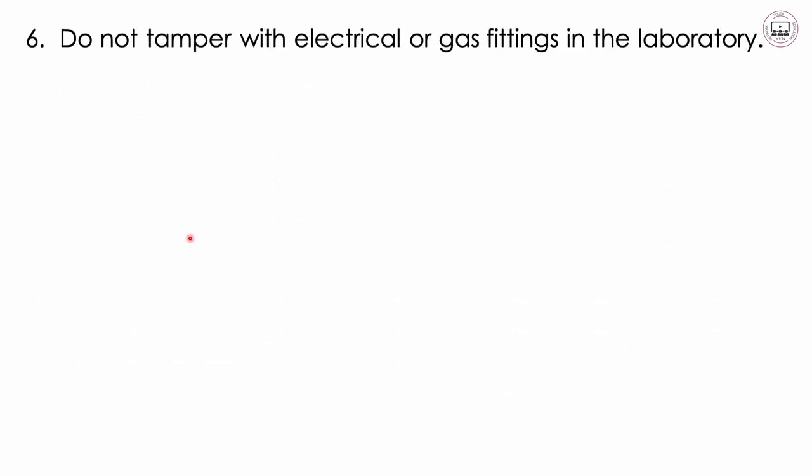Then 6, do not tamper with electrical or gas fitting in the laboratory. Electrical things might cause shock, or gases might cause other problems. So do not tamper. To tamper is to play with them.